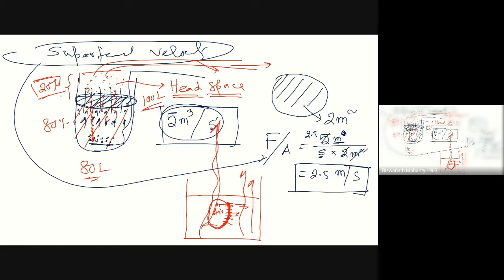Just for guideline. You may say, sir, can I not put 82 liters? Of course you can put. It is not that stringency is there. It is a guideline. Most of the time in bioprocess, we will only be giving you guidelines. There is no strict regulation whether you will do it or not.